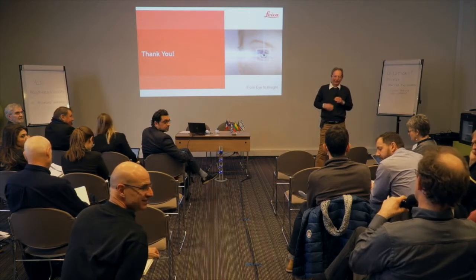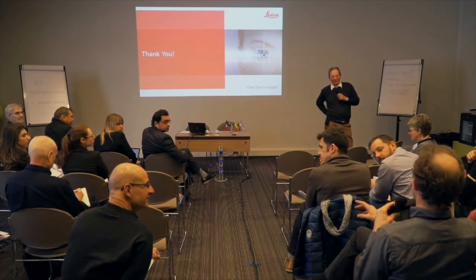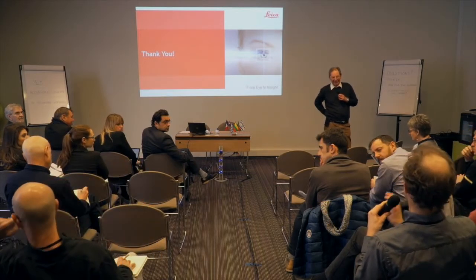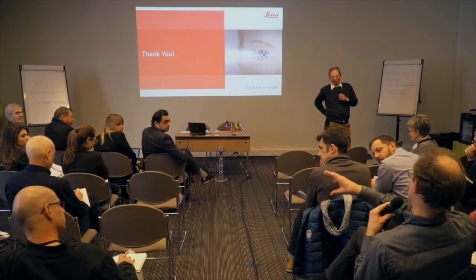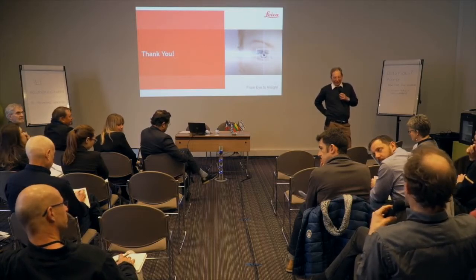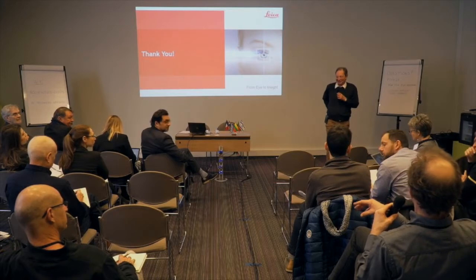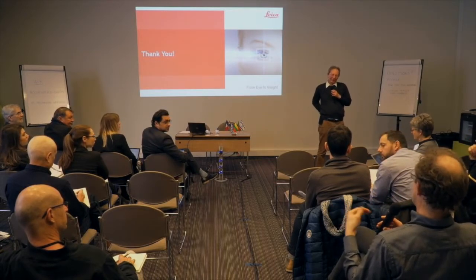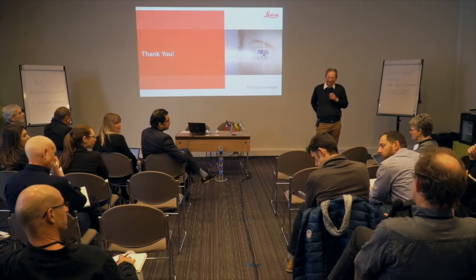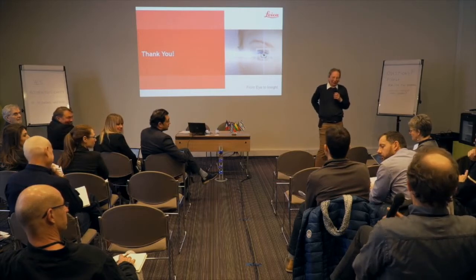The big advantage of a brute force approach, measuring everything on the glass plate instead of what you think is interesting, would be that you can use the data sets as background for further cases. We did already 10 cases, the sets are in the database. We do an 11th case and ask, how special is that? Does this happen more often, these kinds of traces? Well, look through the earlier cases. I know exactly what you mean, because it sounds so familiar from ballistics comparison. If you select beforehand, this is interesting, but this is not interesting, you throw them out and you lose them. So I'm a very big fan of brute force. I look very peaceful, but I'm a big fan of brute force. But if it's not feasible, it's not feasible.